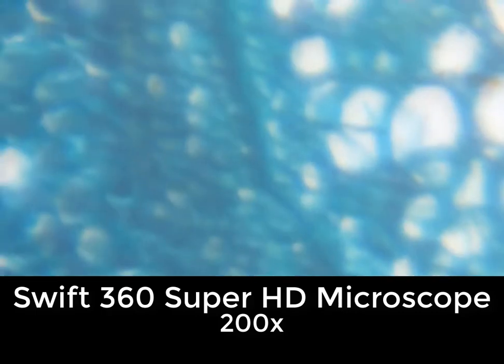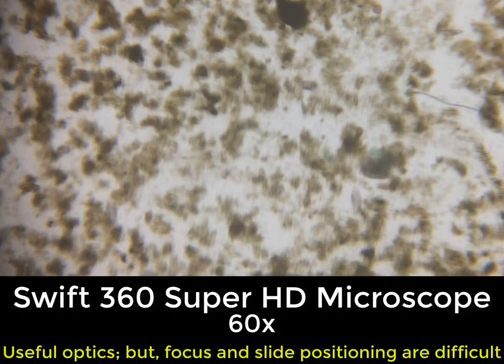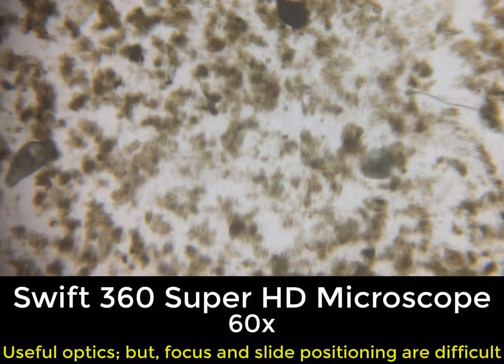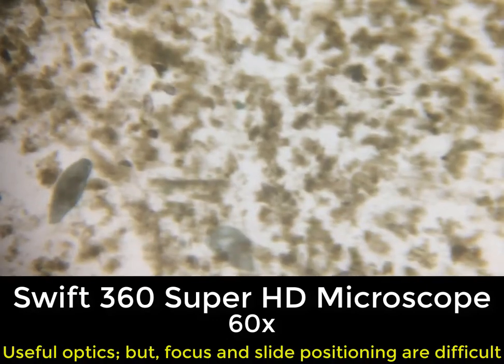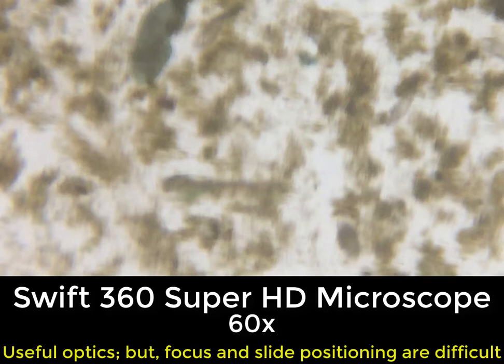We do have some issues with focusing — we'll talk about this later. What we'll see here is that this has somewhat useful optics; it's not as bad as most of the toy microscopes. However, it can be very difficult to focus, and slide positioning is also very difficult. When you're trying to chase down protozoa that are moving, things can get very tough. Here we are at 60 power, and we'll show it at 120 and then again at 200. Remember, we can zoom in and out using our fingers on the smartphone.